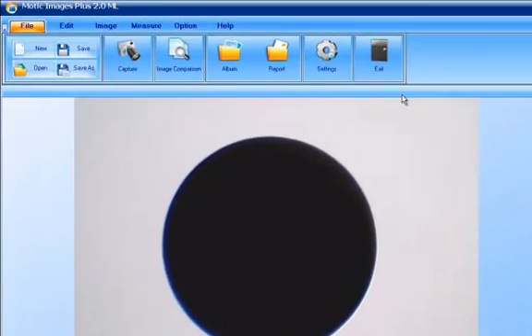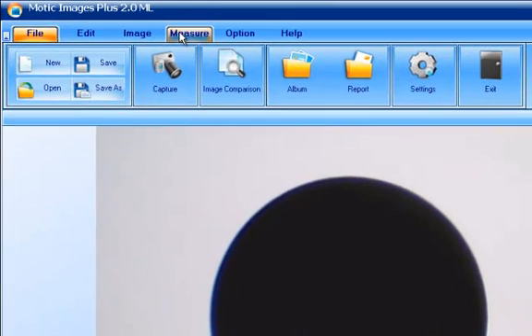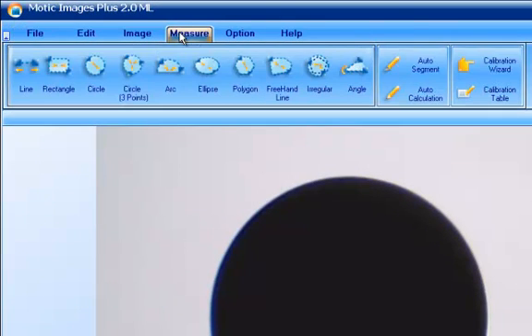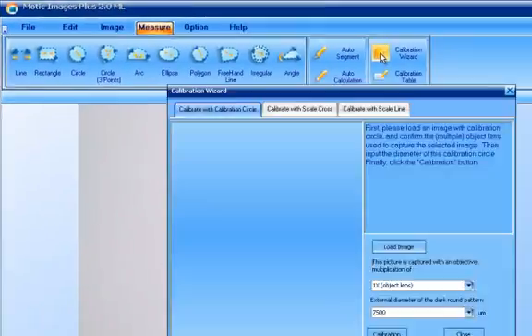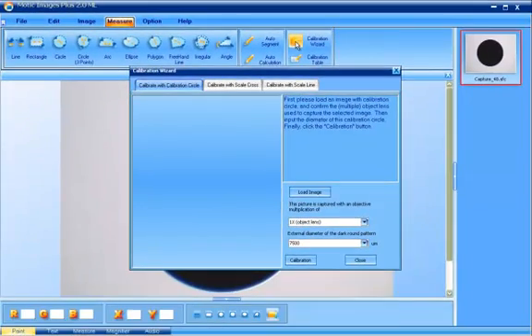So this is the image that we've just captured. In order to calibrate, click on the measurement tab and find and click on the calibration wizard.